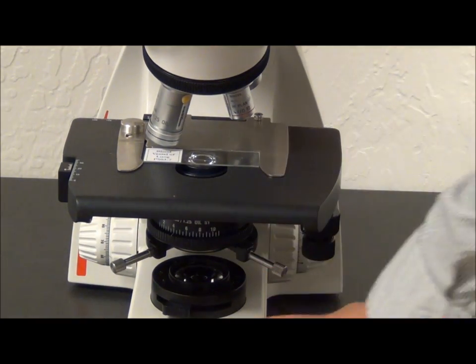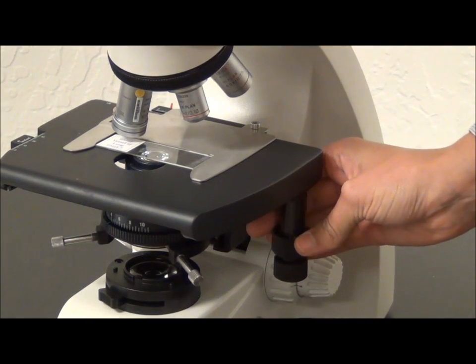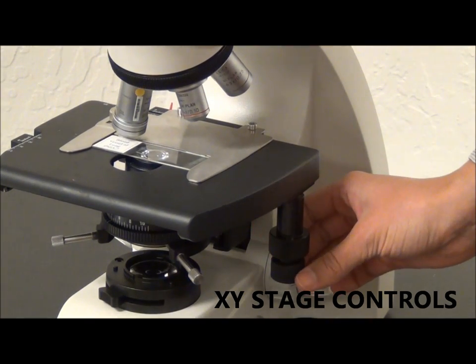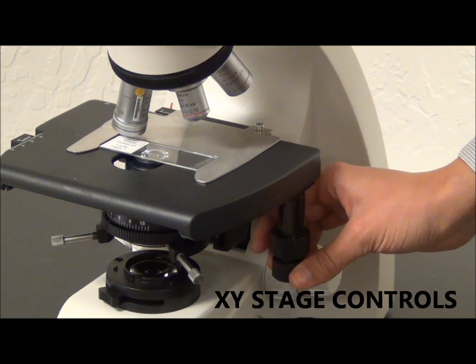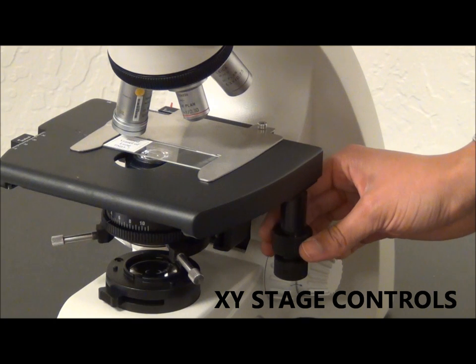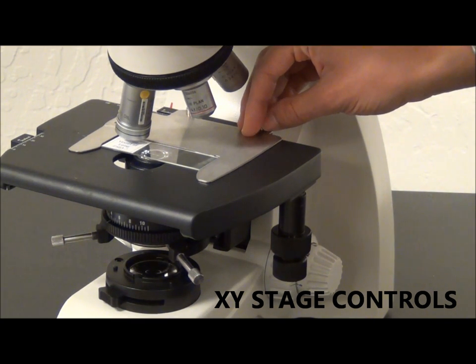This is your stage. These knobs will control the movement of your stage and slide holder in the X and Y axis. If you spill anything on the stage, you can clean it very carefully with water or isopropyl alcohol. If you spill anything under the slide holder, you can remove the screws and clean under it.